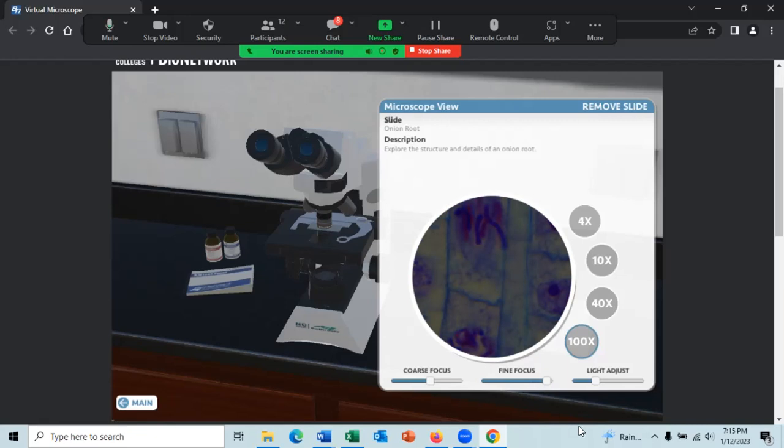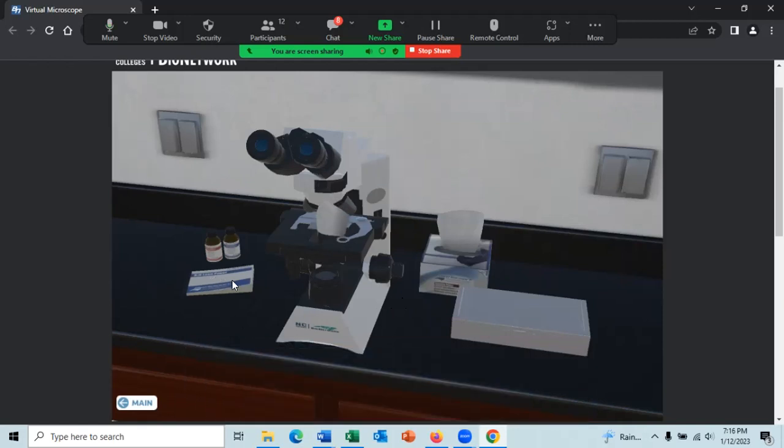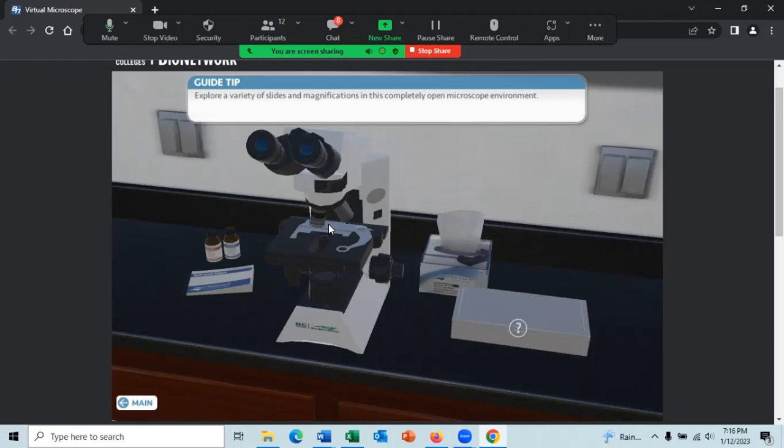All right, any questions on how you use this microscope? Remove the slide. You got to use lens paper to remove the oil from the objective lens, and you're putting the slide in the slide box. And then rotate to the 4x lens, which is what you should do when you're done. Move the 4x lens into place and then put away the microscope.